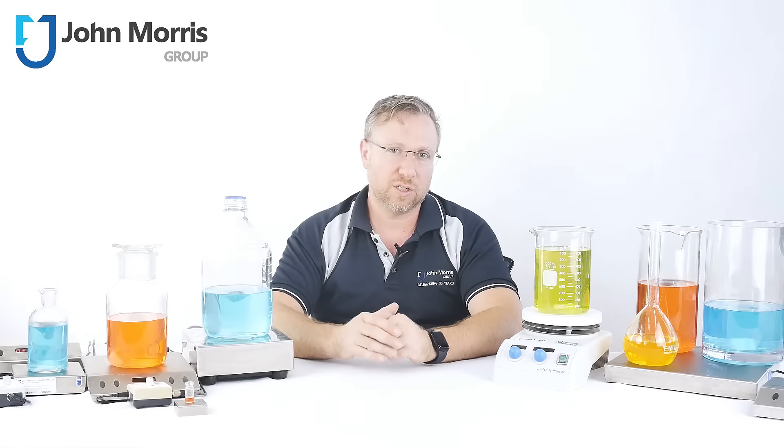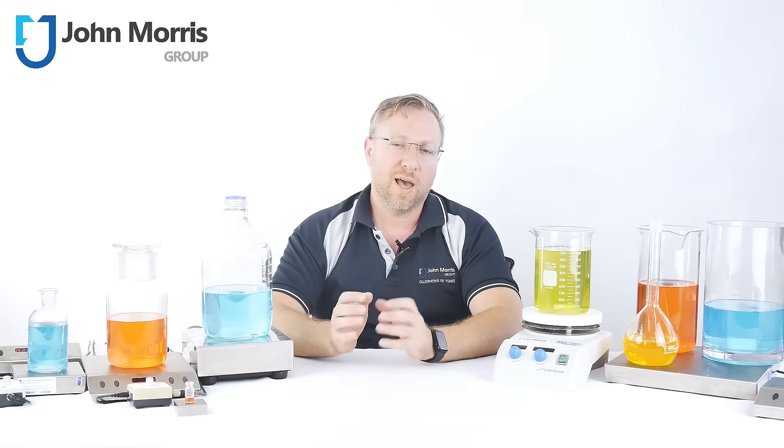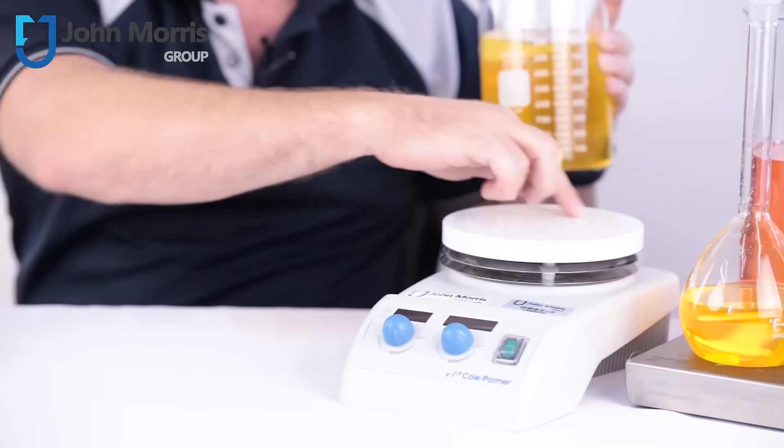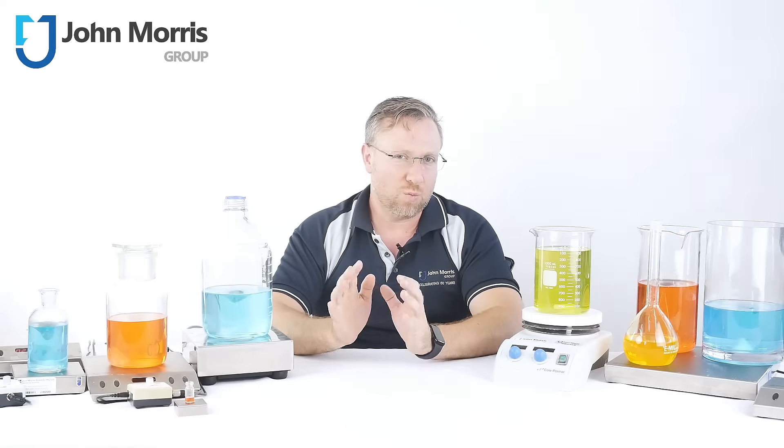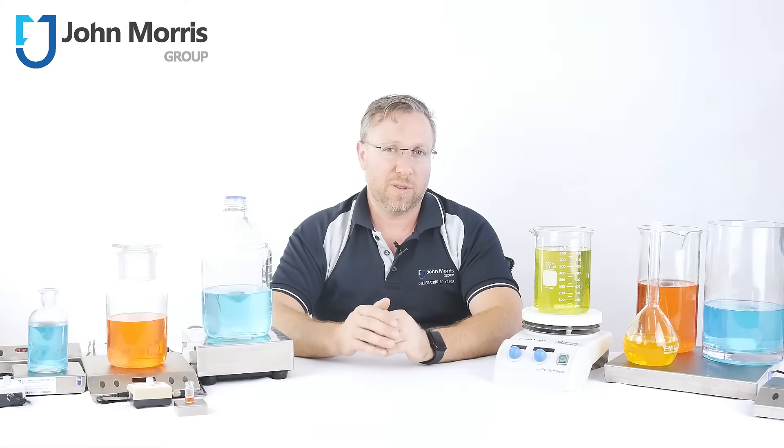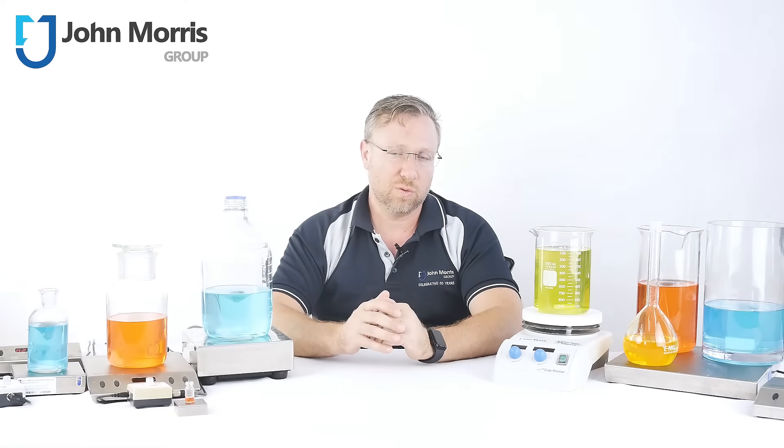Mechanical magnetic stirrers, such as this one here from Stuart, have a permanent magnet stuck to a wheel which is spun by an electric motor. There's nothing particularly wrong with these. They can be inexpensive and they can do the job, but there are times when they're not the best tool for your job.